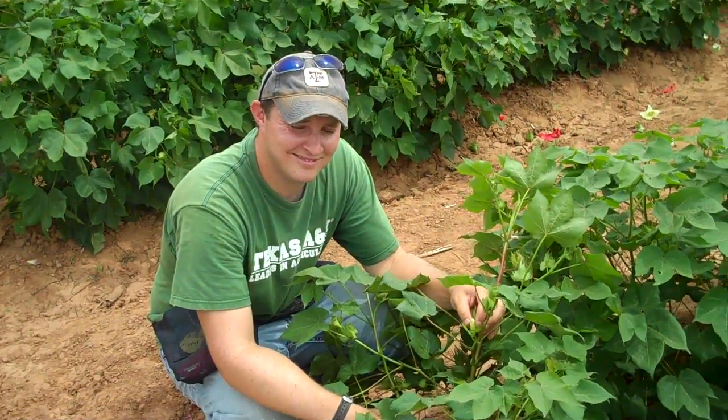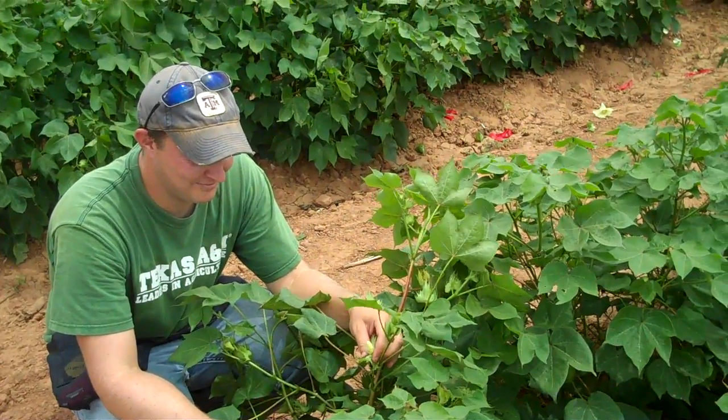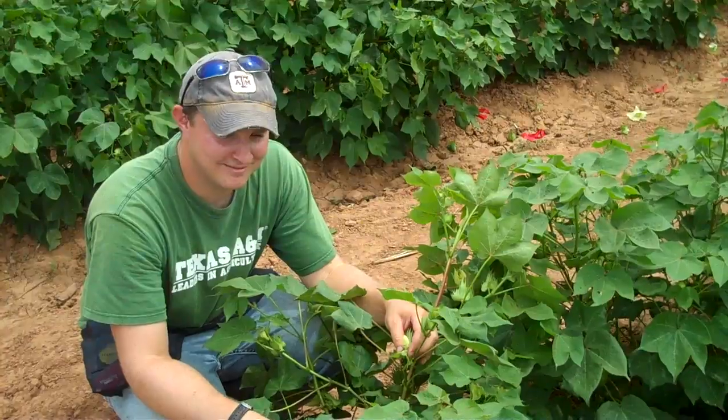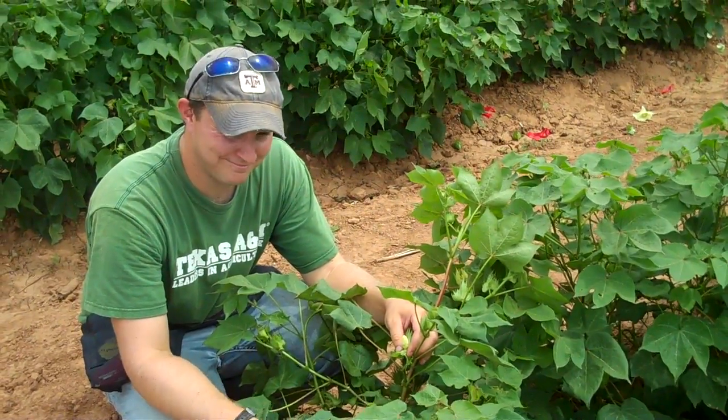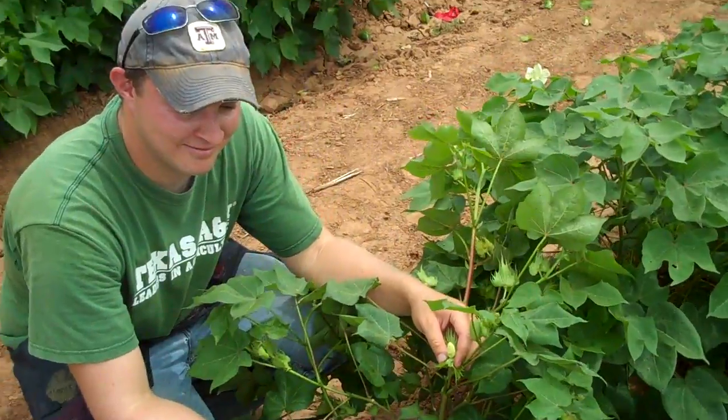With this video we're going to talk about cross-pollination, and more specifically cross-pollination with cotton. With us we have a graduate student working on his Ph.D., Mr. Ben Beyer. Ben, explain very briefly what you're doing here with this cotton plant.